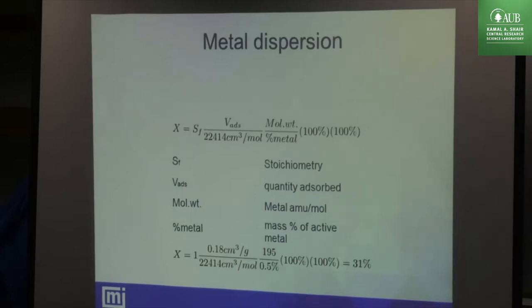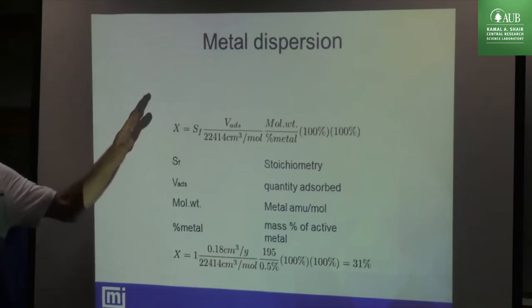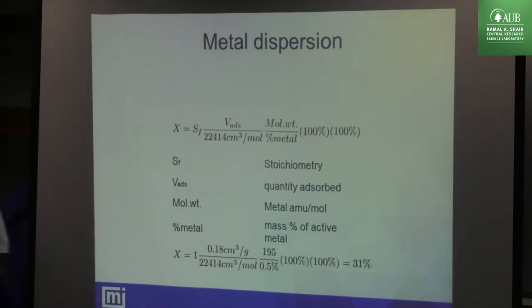If I have 2, we're going to be 60. So I'm getting 1, I'm getting 30, so it's good. Okay? So you can convince the people it does not matter too much if you're taking the stoichiometric factor with 2 or 1 or 1/2. There's no problem. Okay? But in order to make it easy, we consider it 1:1 and work very, very well.